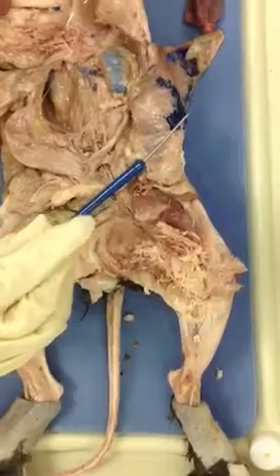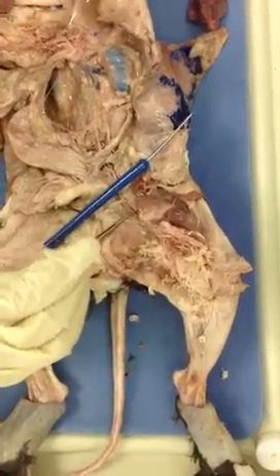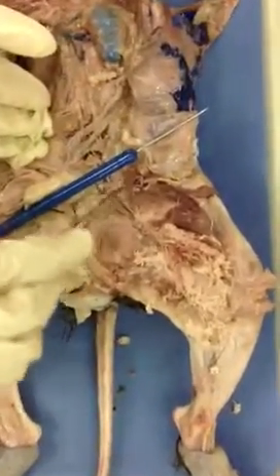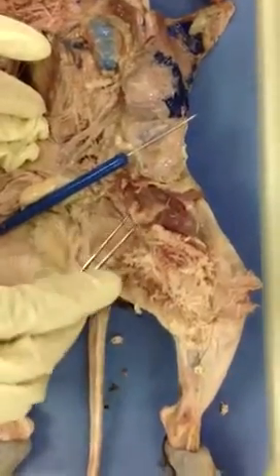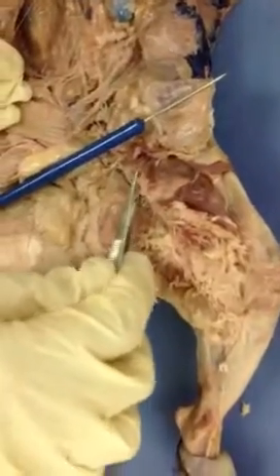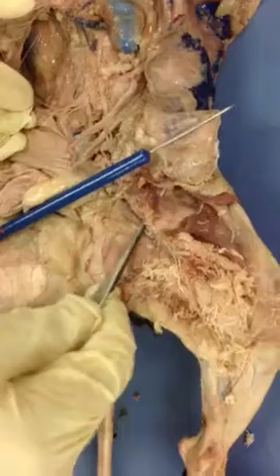But when it passes the imaginary line, now we call it what? Femoral, right? The femoral. You see it? Here it is. So here we see that little deep femoral here. You see it? This is the femoral per se.